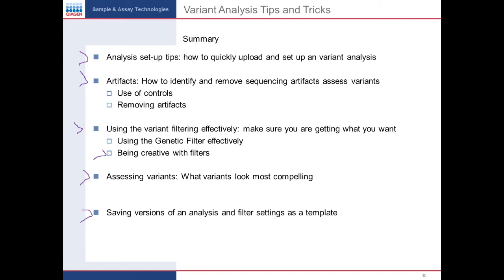But anyway, her question was, when you do a tumor normal case control analysis, why only generate a list of variants in the tumors and not the controls? I'm not exactly sure I understand the question, but let me just give the long-winded answer.